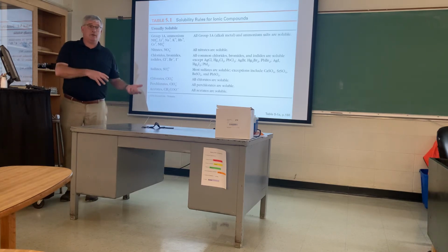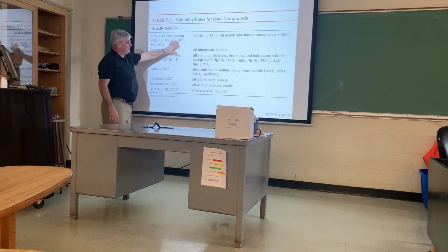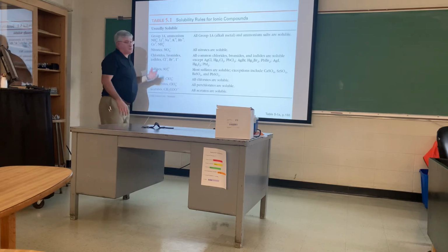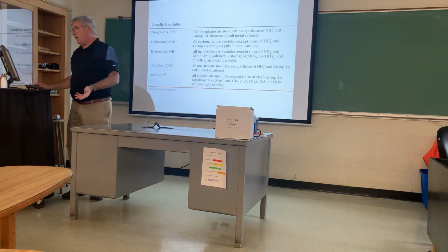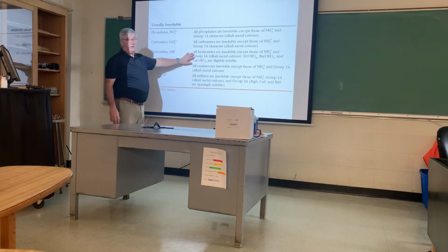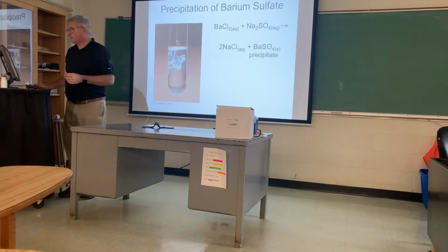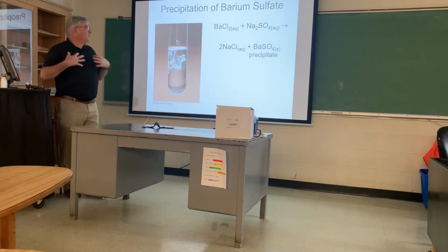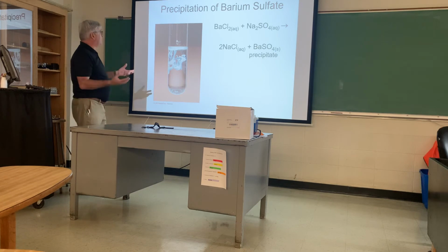That we learned then, because all of that in terms of ideas is in this scheme. Now, it doesn't explain the complexes, for example, with the hydroxides that form with your amphoteric metals.